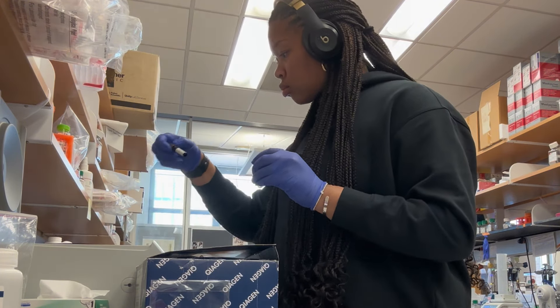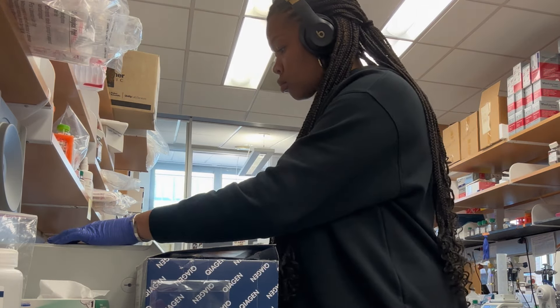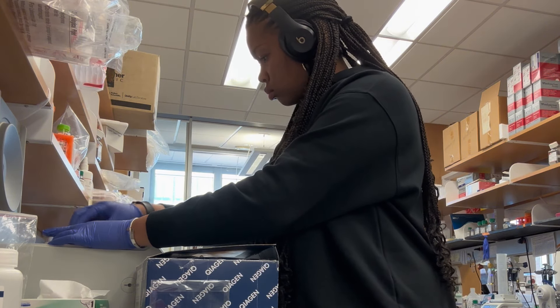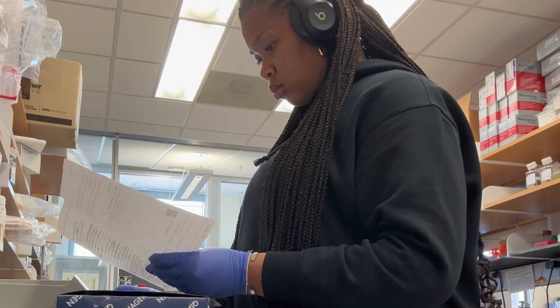Once I do that, it's ready to go into the centrifuge. I'm placing my two samples in there, making sure it's in there correctly. I found something in there that was supposed to be in there, so I'm just gonna pop those in. You have to make sure you hear a click, because if you don't, you don't want stuff going all over the place.